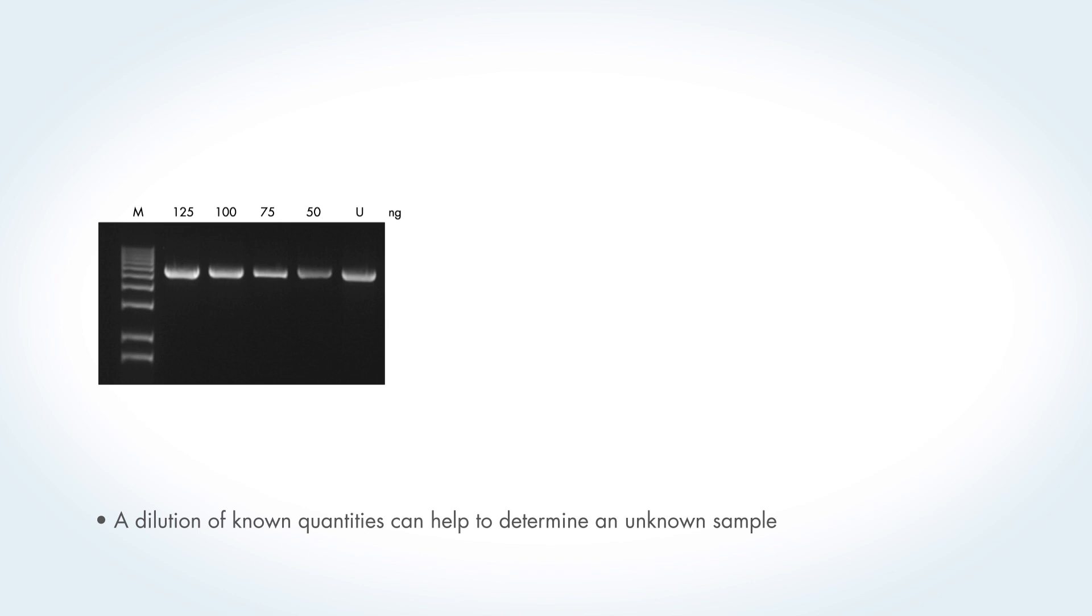If small bands are expected, it's better to load a bit more DNA, otherwise the ethidium bromide will not be able to intercalate so efficiently and the bands will be fuzzy. Where you don't know the amount of a certain fragment, you can load a dilution and estimate by visual comparison with a standard.